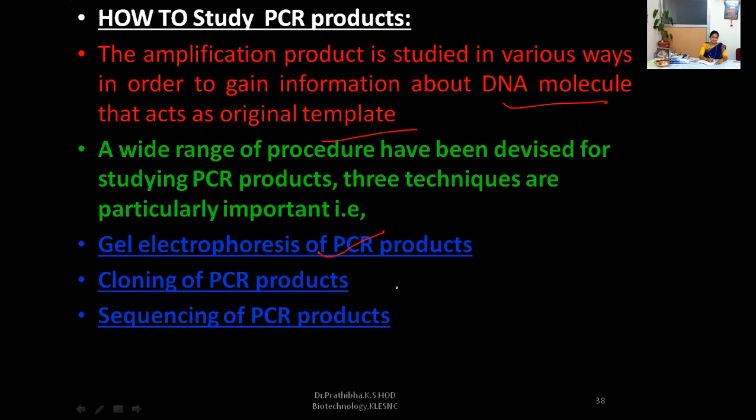Again, plasmid DNA will be introduced into a host system, and further we can go for understanding that introduced DNA molecule. Also, to study this PCR product we can perform sequencing of the PCR products. Sequencing is nothing but the study of the arrangement of the nitrogenous bases. That can be done to this PCR product. So we can go through DNA sequencing.